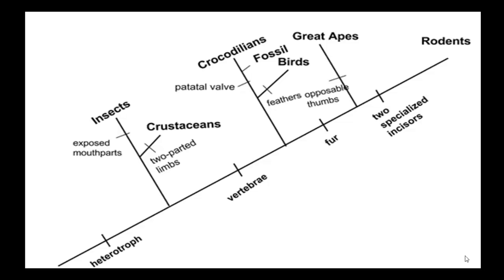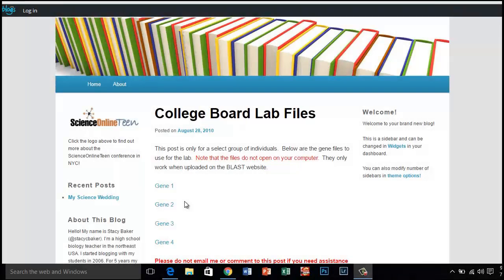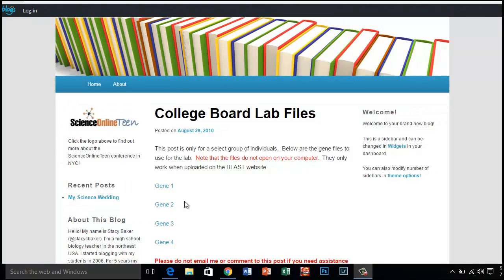Now let's learn to use BLAST. The first thing you need to do is to download the gene files from the Blogging for Biology website. I have placed the link on the Google Classroom.